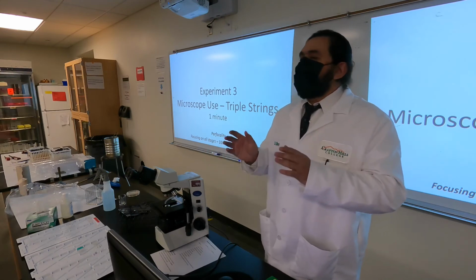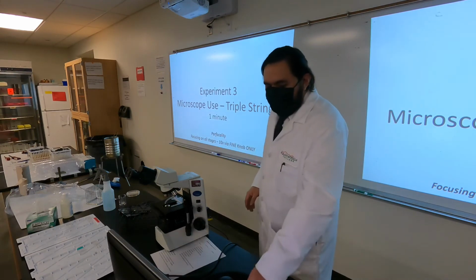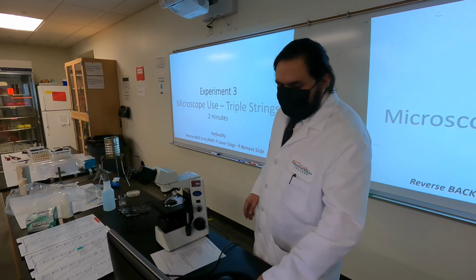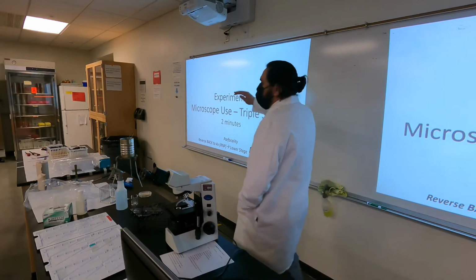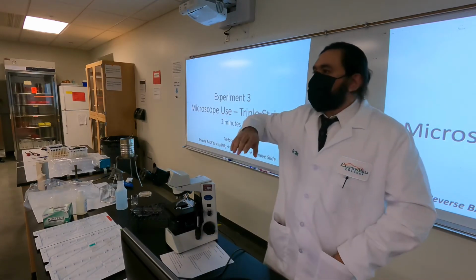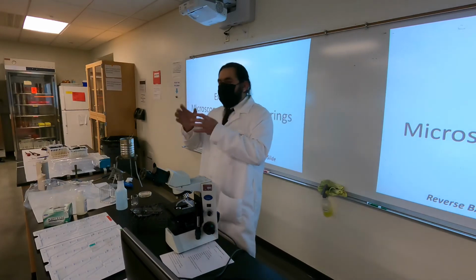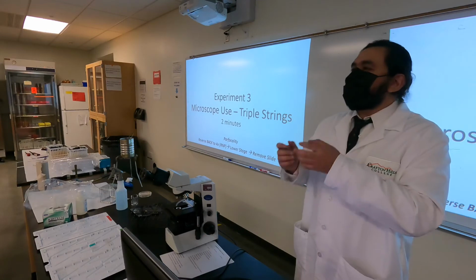We're gonna go one more time. Again, make sure it's centered, make sure that it's nice and sharp before we go from our 10X to our 40X. Okay, so we went through our triple strings. We decided which one is on top, bottom, and middle, all the way up to the blue. Now we're gonna go in reverse to put things away. So that means go from the blue back to the yellow, from the yellow back to the red, which is where you reset, and then you're gonna bring your stage down, and then you can take out your slide.